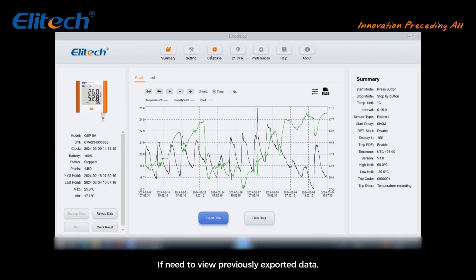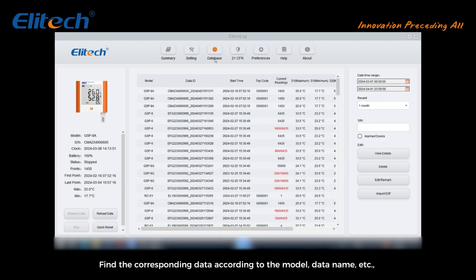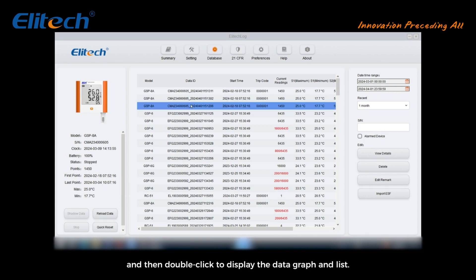If you need to view previously exported data, click the database button above. Find the corresponding data according to the model, data name, etc., and then double-click to display the data graph and list.